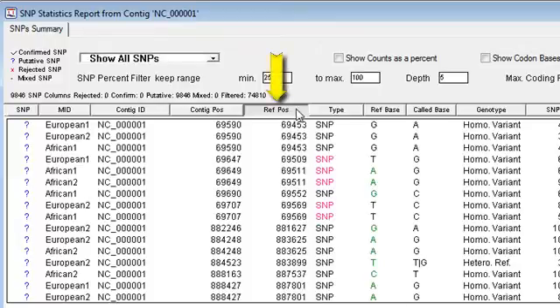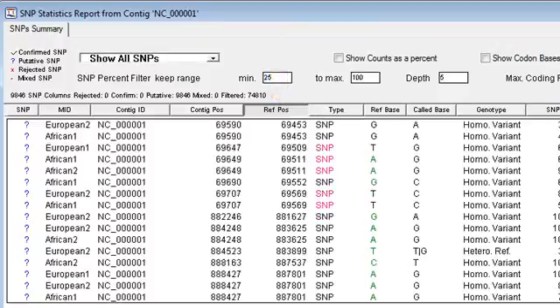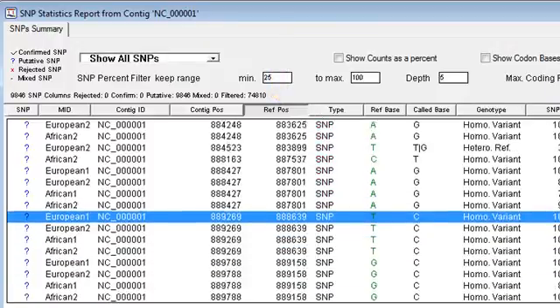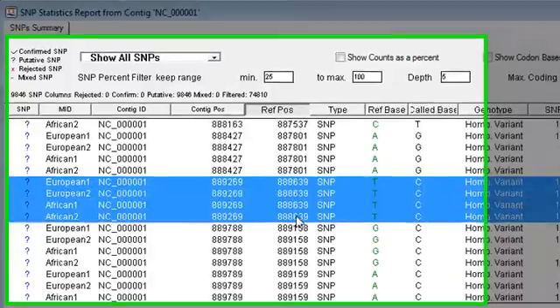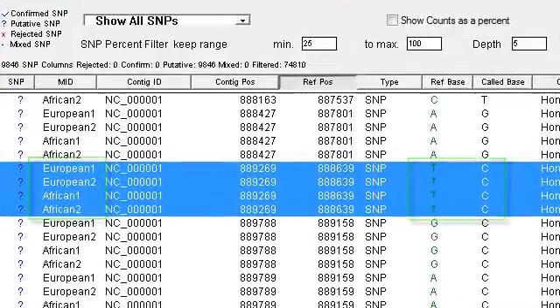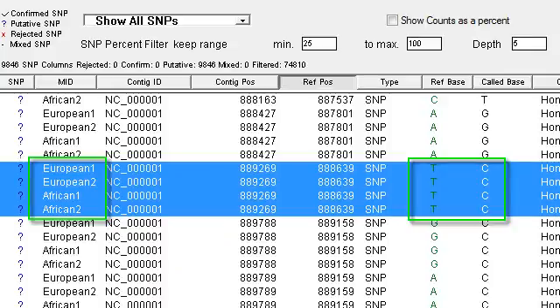Now, if I sort by reference position and then scroll down my list a little bit here, I can see, for example, at this position I have the same SNP occurring in all four individuals.